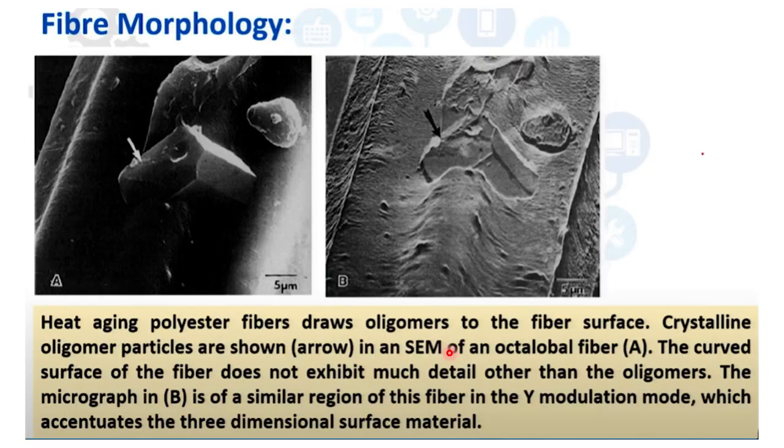So this is showing the electron microscope image of a fiber.